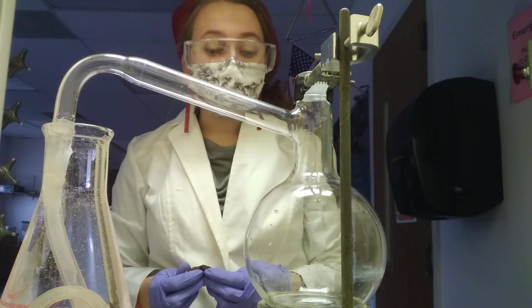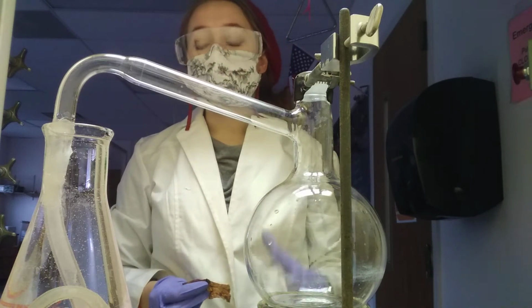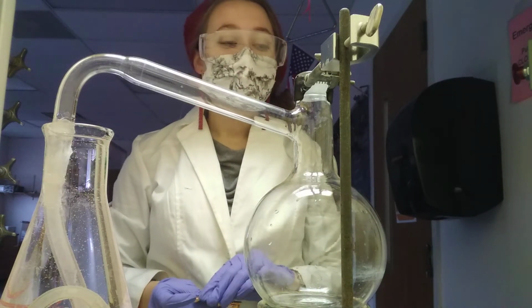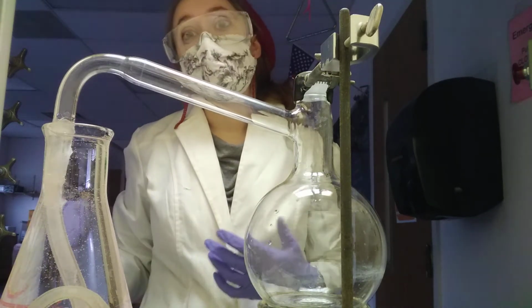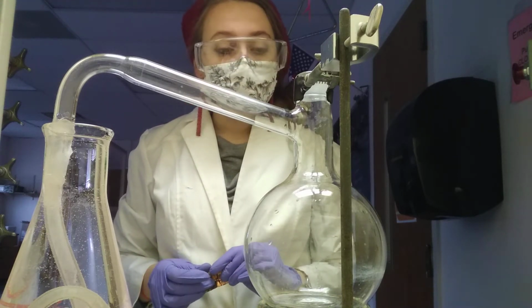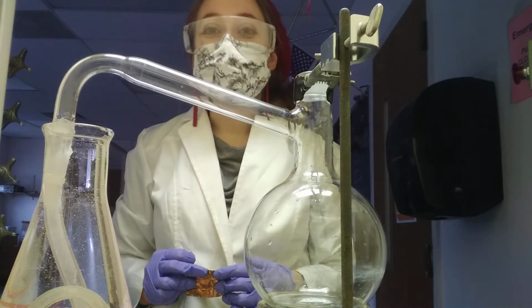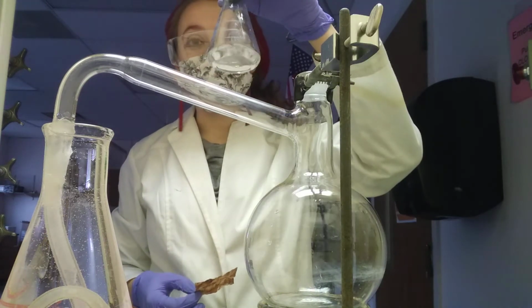What does it mean for a chemical reaction to take place? And also, what are we looking for when we're looking for a chemical reaction to take place? How do we know that this is going to be a chemical reaction, whereas boiling water is not a reaction, it's just a phase change? So we will go ahead and get started, and then we'll talk about some of the things that we'll look for. This right here is our nitric acid.